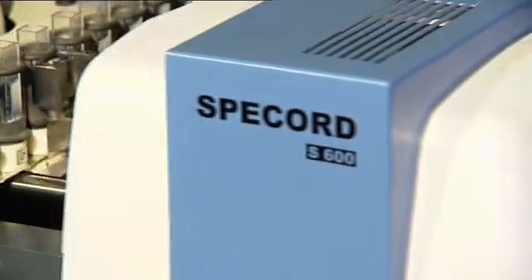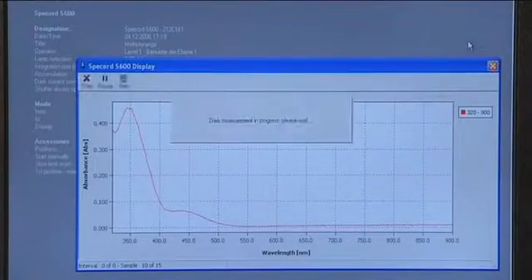Extremely fast analysis. The spectral range from UV to NIR can be registered in less than 12 milliseconds. Because of the open sample compartment, samples and accessories may be changed quickly and easily.